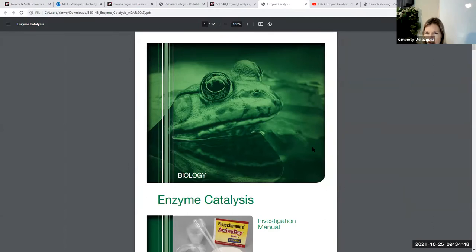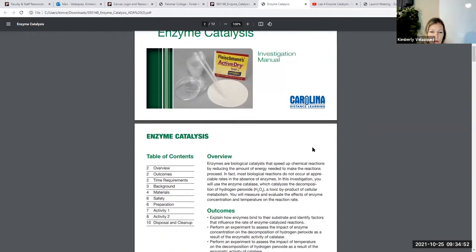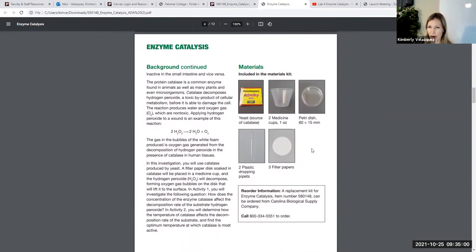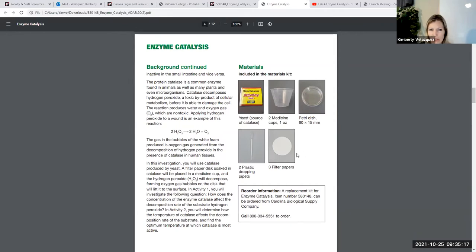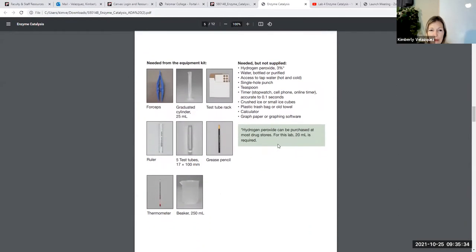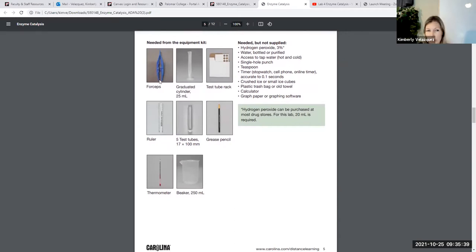Here's the lab activity we're doing this week — just activity number one. Regarding materials: at the beginning of the semester there was a list of additional materials, and one of them was a hole punch, which gets used this week. The lab bag for enzyme catalysis contains yeast, medicine cups, a petri dish, two plastic dropper pipettes, and three filter papers.